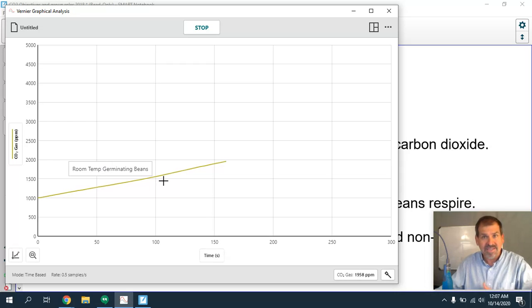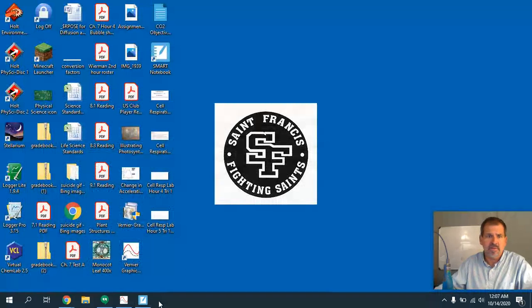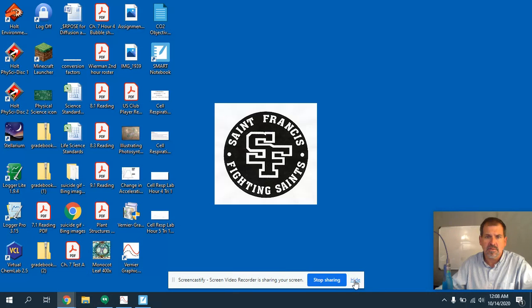All right, so we don't need to sit through this whole downtime as we wait for the data to collect. So I'm just going to minimize this and pause this for just a second.